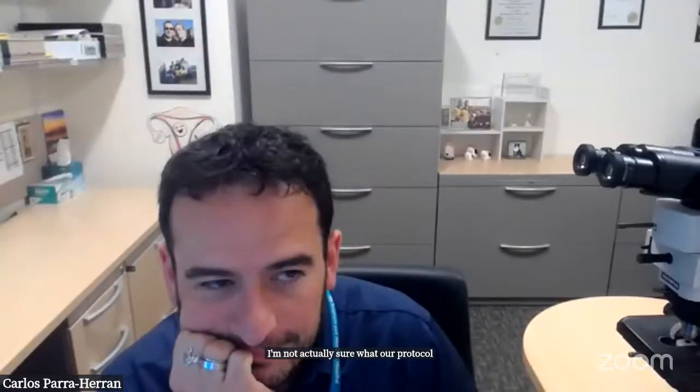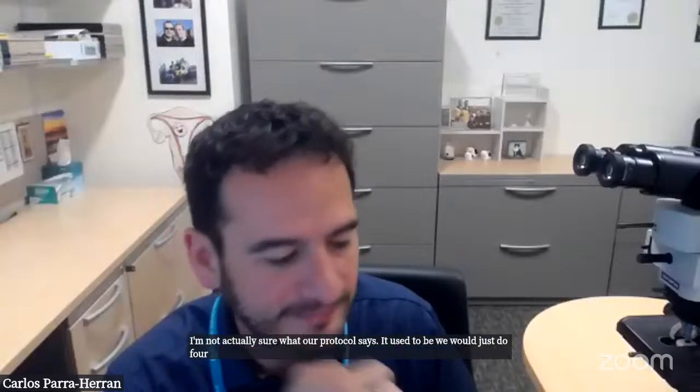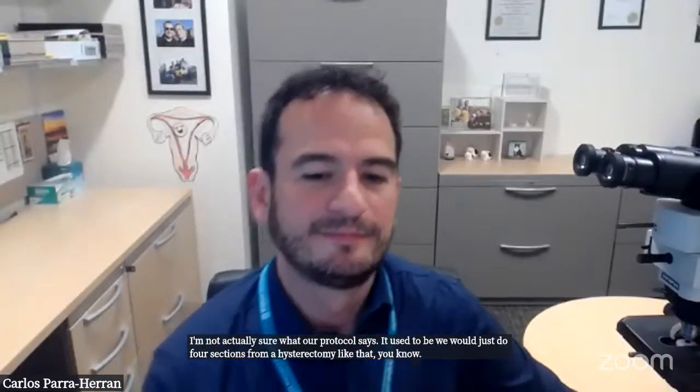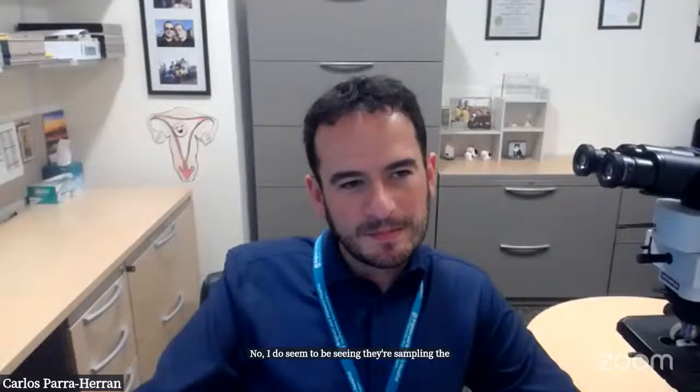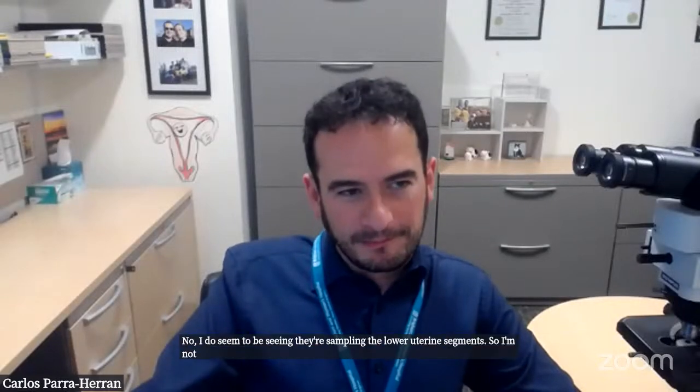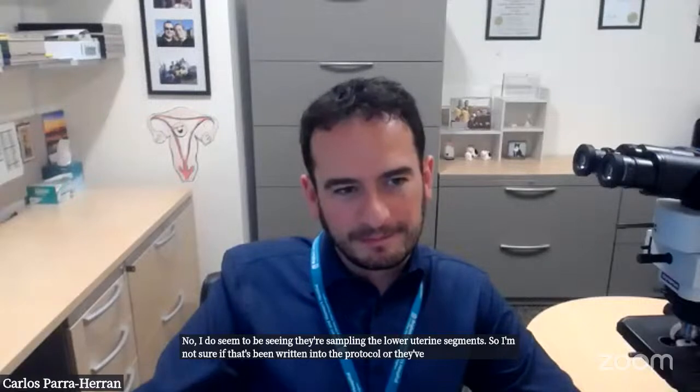It used to be we would just have 4 sections from a hysterectomy like that, 2 from the cervix and 2 from the endometrium, myometrium. But now I do seem to be seeing they're sampling the lower uterine segment. So I'm not sure if that's been written into the protocol or they've just decided to do that. What about you, Karen, in Melbourne?